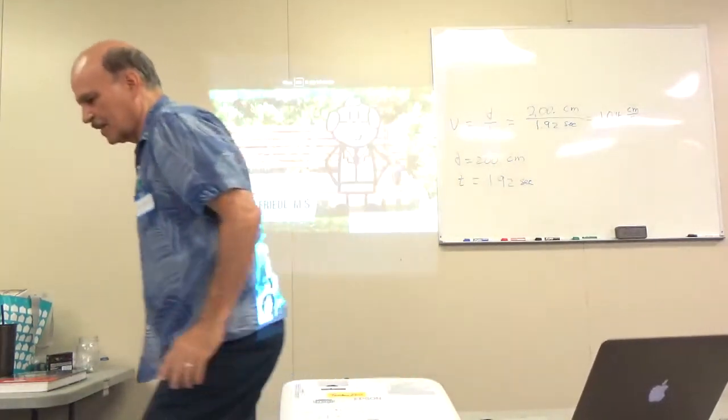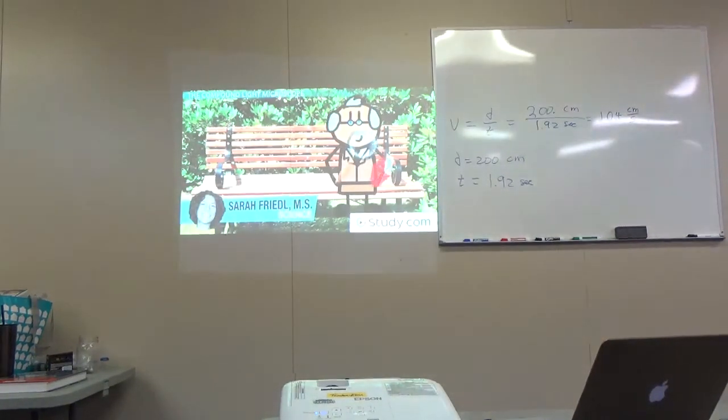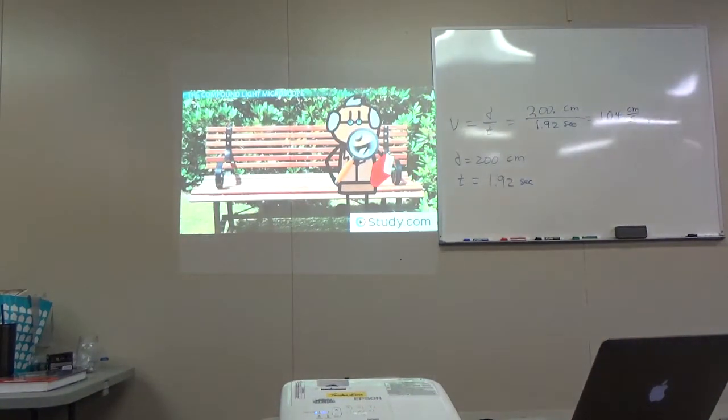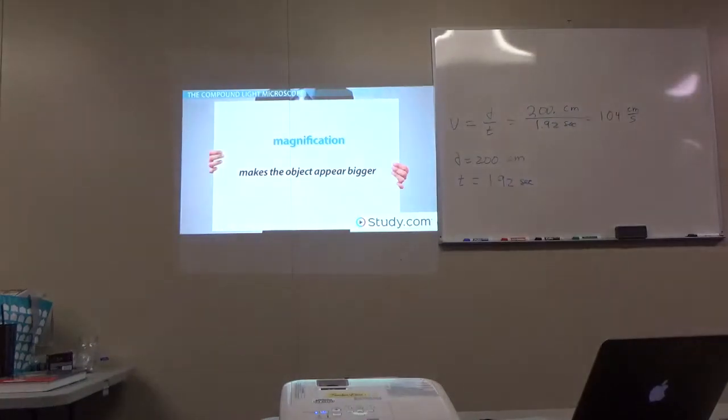As we get older, our eyes are not able to see things as clearly, especially things that are small. We may get a magnifying glass in order to help us read and see small objects, and this helps because magnification makes the object appear bigger, so we see it more clearly. To take notes? A microscope does the same thing, but for very, very small objects.